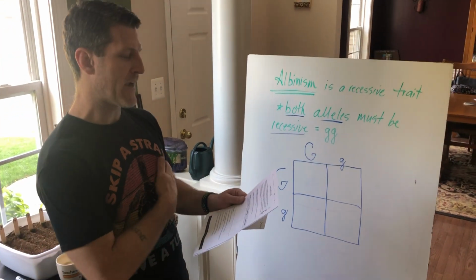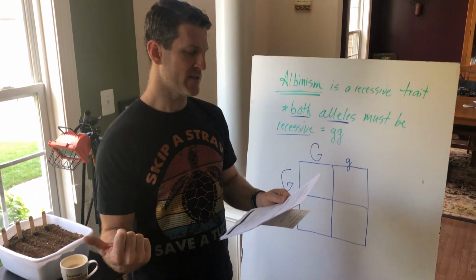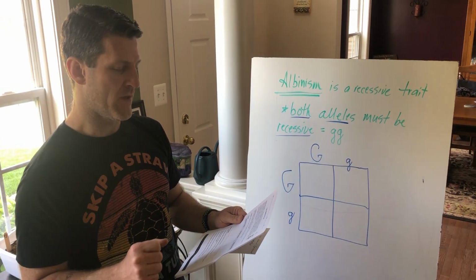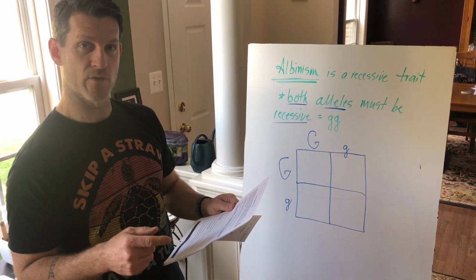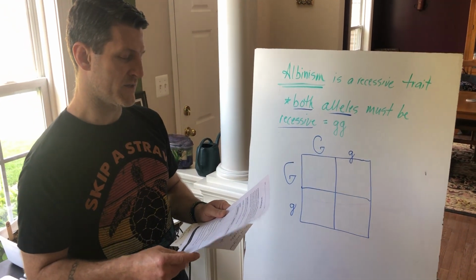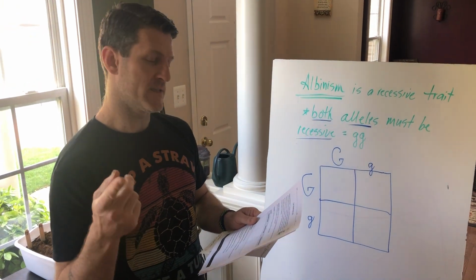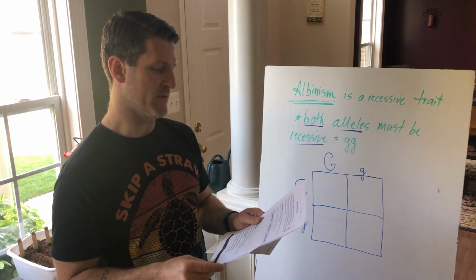All right, so first of all, it says background information. You will plant, Mrs. McGough and Alex, seeds today that carry genes for producing plants that make chlorophyll, the green pigment in leaves, as well as genes that lack the ability of making chlorophyll. Plants have the probability of carrying genes for making chlorophyll or lacking the ability. So the lacking would be a lowercase g. Capital G would represent the ability for them to express production of chlorophyll. The genotypes of the plant seeds will be big G, big G, homozygous dominant, big G, little g, heterozygous, or little g, little g, homozygous recessive.